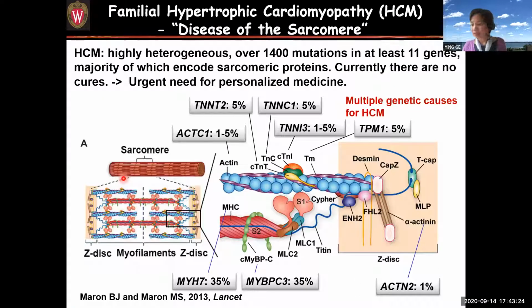Okay, so I'm just quickly going to show you a recent study that we have with hypertrophic cardiomyopathy. Remember, we said the top-down approach can show post-translational modifications together with protein mutations and alternative splicing isoforms. So I thought it would be really useful to study this genetic disease. For example, HCM, hypertrophic cardiomyopathy, is caused by genetic mutations in proteins of the sarcomere. But it's so diverse, right? There are so many different causes that it requires precision medicine.